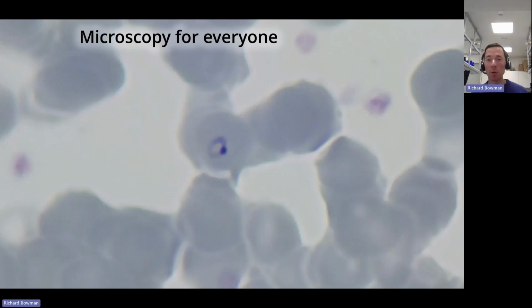I usually put "microscopy for everyone" in the talk title, and perhaps it will help to understand where the project comes from. If I say, why does everyone need microscopy? There's loads of reasons: education, scientific research, inspecting products. But what's really pushed this project over the last few years is this guy. So this is a Plasmodium falciparum. It's the parasite that's responsible for giving you malaria.